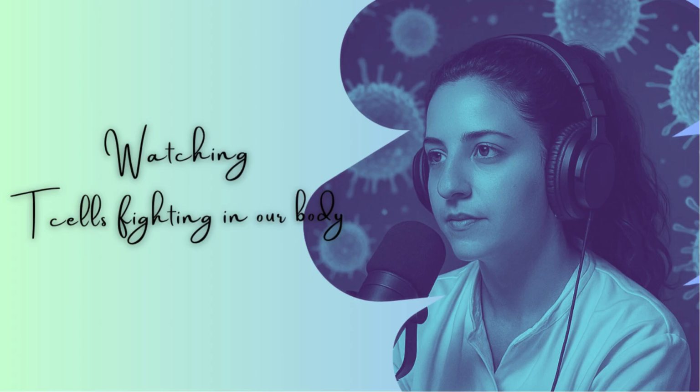Then we have real-world applications. Flow cytometry isn't just a lab technique, it's used in clinical trials to monitor immune responses to vaccines and therapies, and in autoimmune research to understand dysregulated T cell subsets. It's also used in cancer immunotherapy, especially with CAR T cells, where we are tracking their activation and their exhaustion. It's also used in COVID-19 research to study the T cell responses during infection and recovery. So it helps us watch the immune system response in real time, and that's incredibly powerful for both research and medicine.